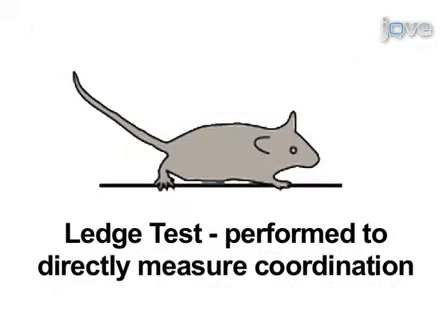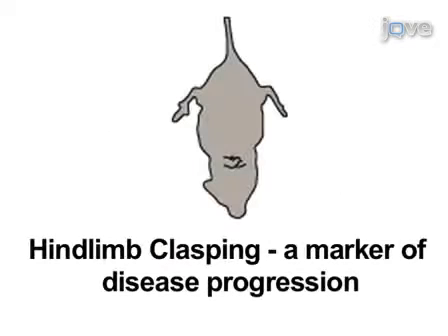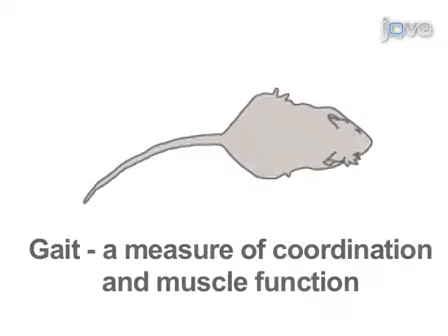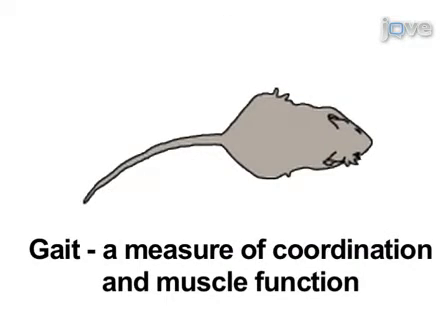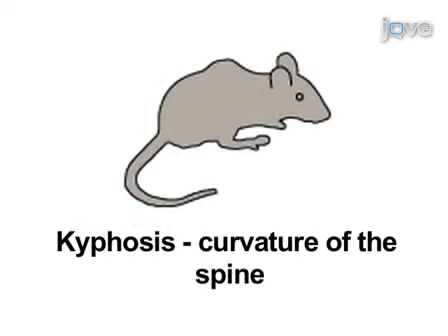The ledge test is performed to directly measure coordination. Hind limb clasping is a marker of disease progression in a number of mouse models of neurodegeneration. Gait is a measure of coordination and muscle function. Kyphosis is curvature of the spine in the cervicothoracic region, common in mouse models of motor system and spinocerebellar neurodegeneration.